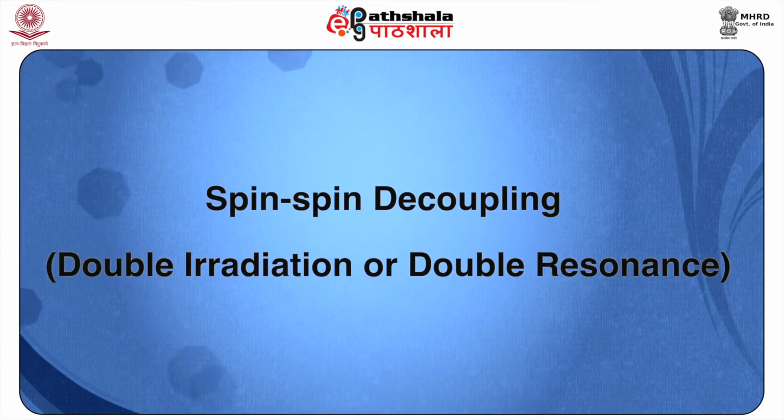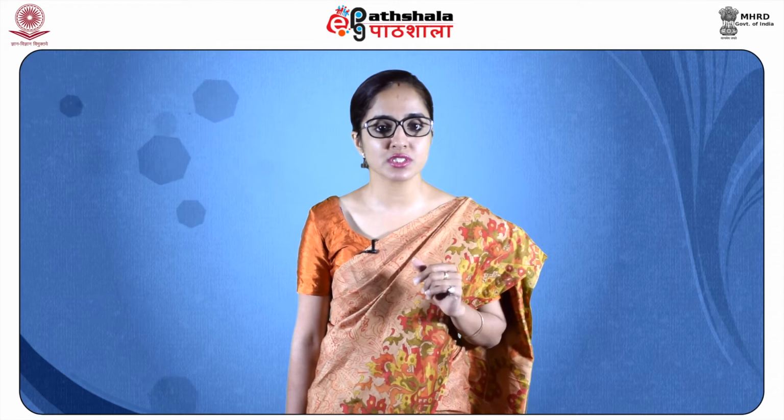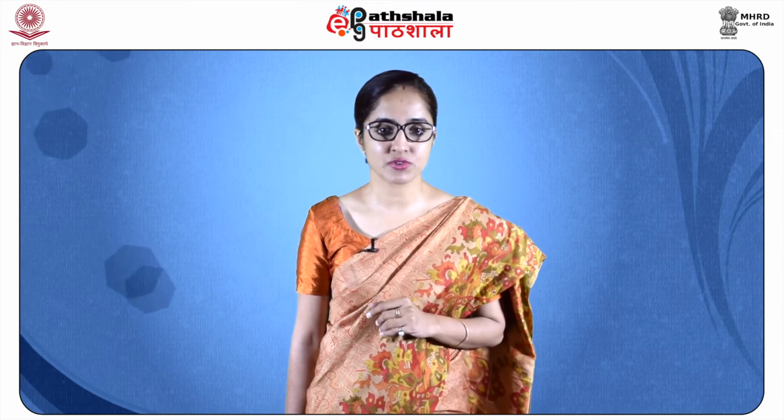Let's come down to the topic of spin-spin decoupling or double irradiation or double resonance for the simplification of complex spectra. The spin-spin coupling between neighboring nuclei results in the signals splitting, causing different multiplets. However, in certain cases, the splitting patterns are very complex. The spin-spin decoupling technique is used to simplify the NMR spectra.